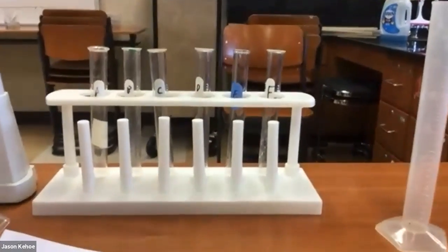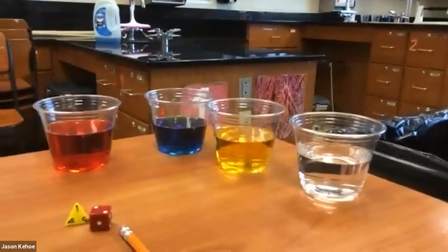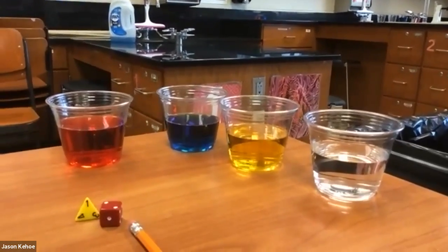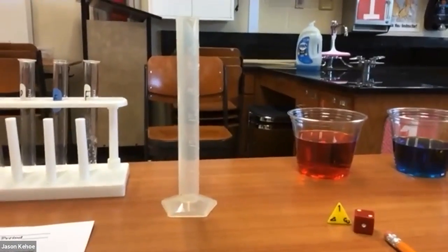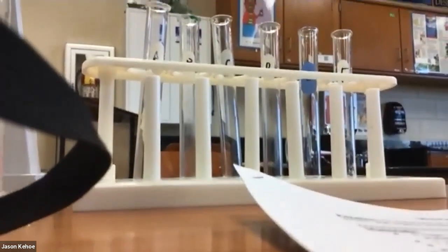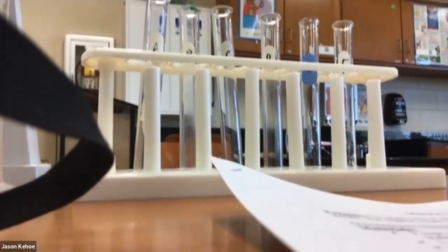There we go. All right, so for this first part, the volume challenge, we're going to be using six test tubes labeled A through F and three different types of colored water, red, blue, and yellow, a pipette to help transfer small amounts of liquids, and graduated cylinders, a large one and a smaller one if we want smaller, more precise measurements. And we're just going to follow along and do this as best we can virtually. I have read through these directions in their entirety already, so I'm just going to start.